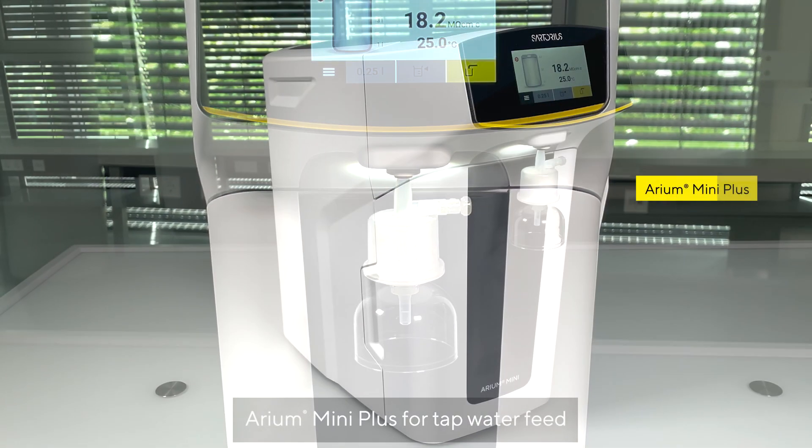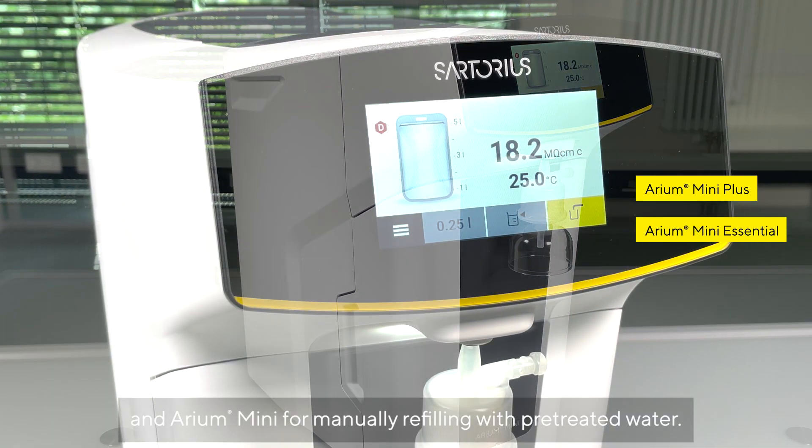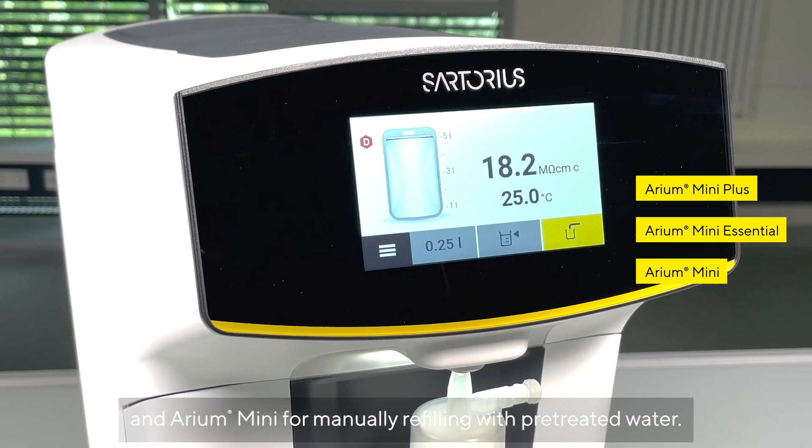Arium Mini Plus for tap water feed, Arium Mini Essential for pre-treated water feed, and Arium Mini for manually refilling with pre-treated water.